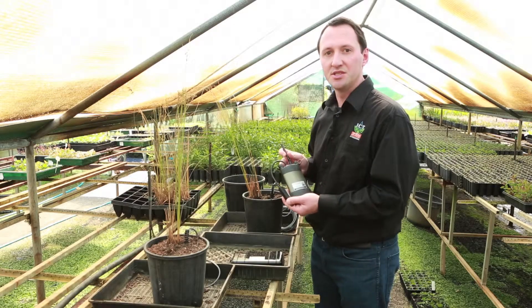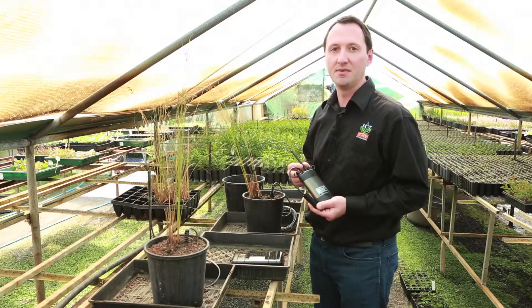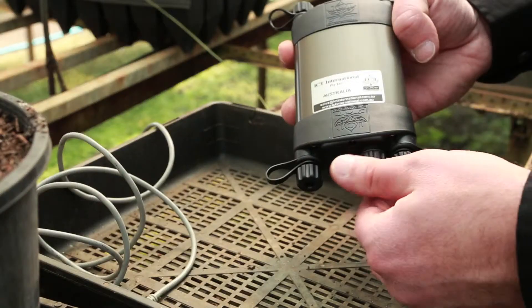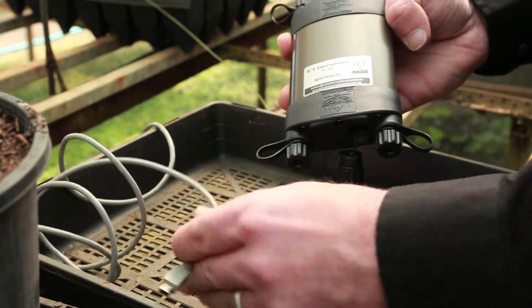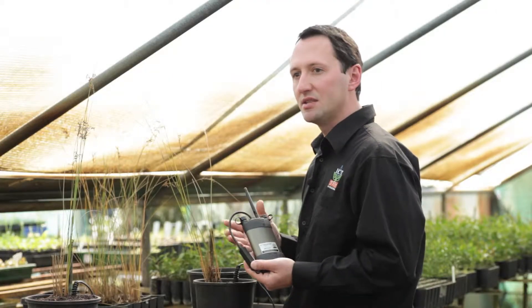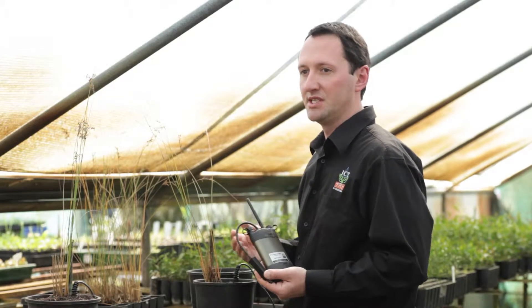Once everything is connected simply use the Windows instrument interface to set the logging interval and that's it. The SOM soil oxygen meter has a micro SD card which can store many years of data. To communicate with the SOM you can simply use a USB cable to connect directly to the instrument. It also has wireless capabilities so you can connect wirelessly from your office up the corridor or remotely anywhere in the world through the GSM network.